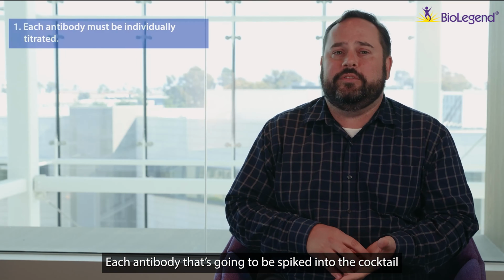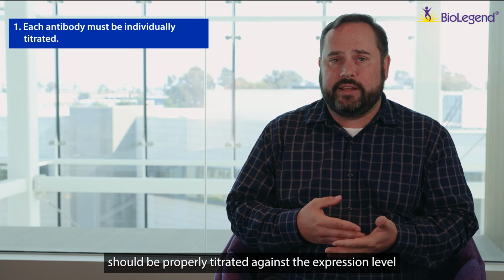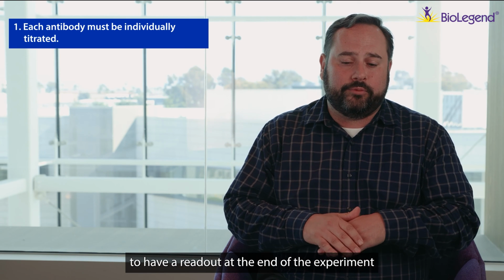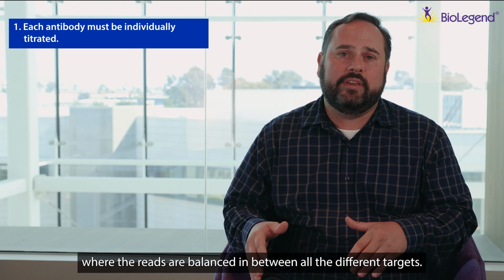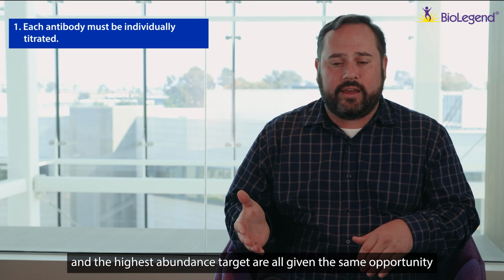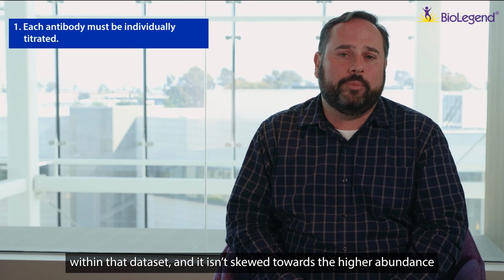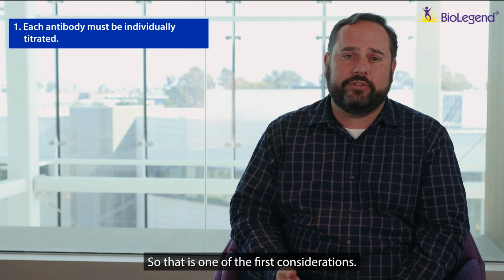Each antibody that's going to be spiked into the cocktail should be properly titrated against the expression level for that particular sample type to make sure that it is used in an appropriate range to have a readout at the end of the experiment where the reads are balanced in between all the different targets. This allows the researcher to ensure that the lowest abundance targets and the highest abundant targets are all given the same opportunity to be gathered within that data set, and the data set isn't skewed towards the higher abundant proteins in that particular sample. So that is one of the first considerations.